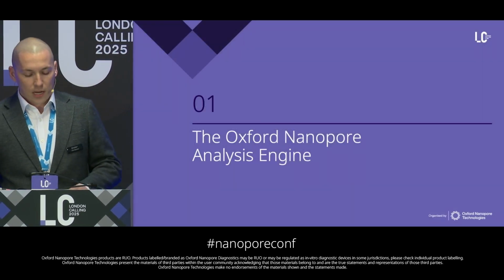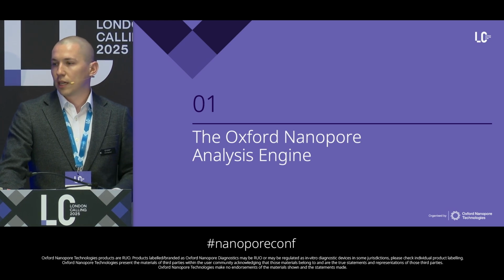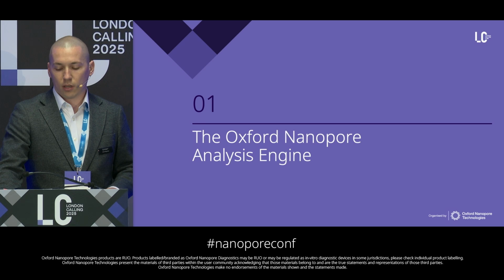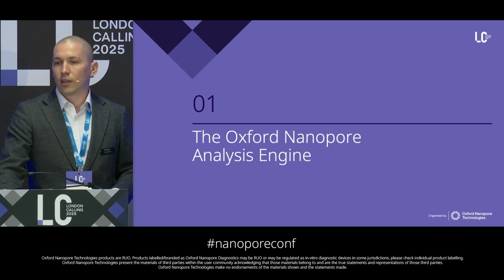Dorado is Oxford Nanopore's engine for both primary and secondary analysis. It started as a base caller, but it's grown into a comprehensive toolkit designed to scale with modern GPU architectures and your research needs.